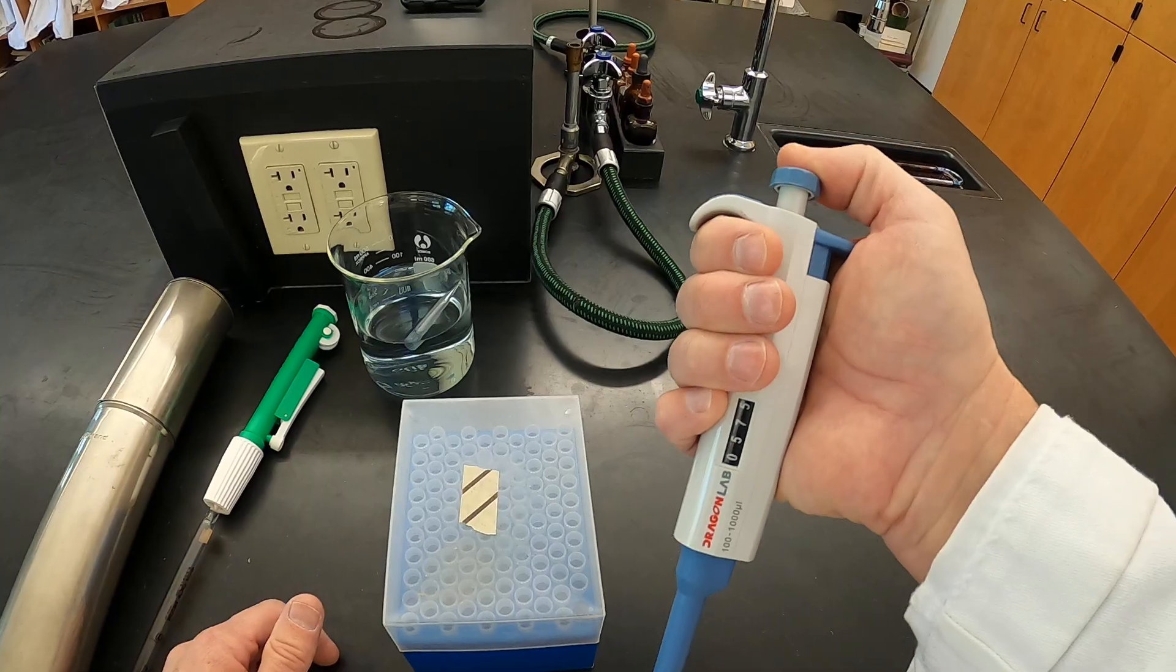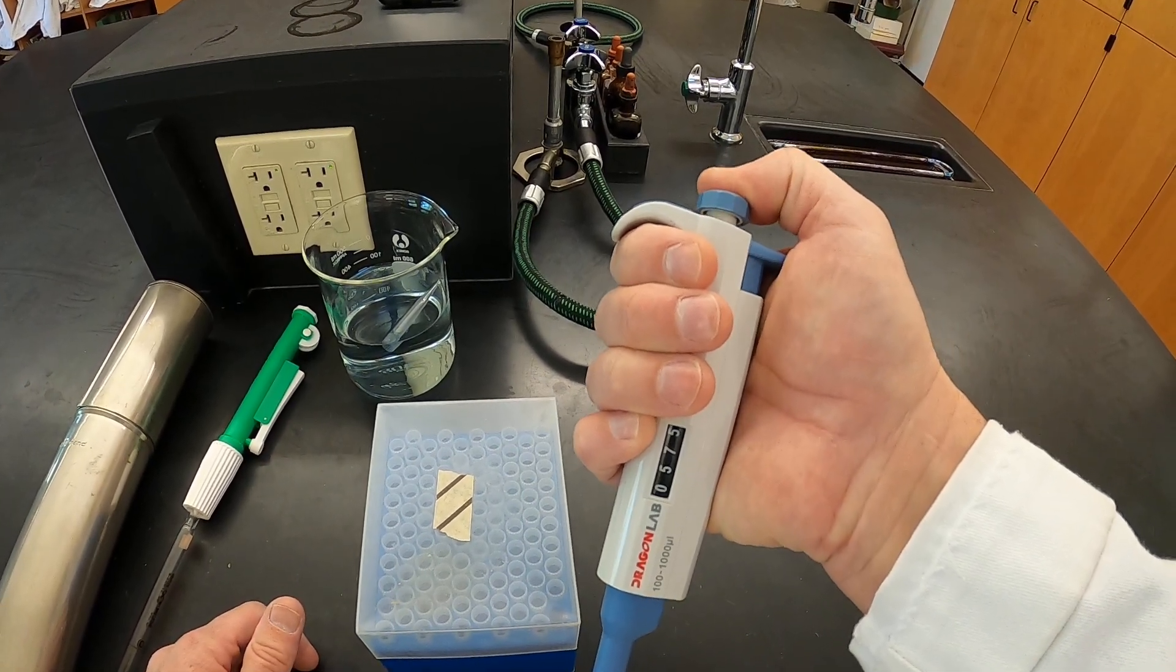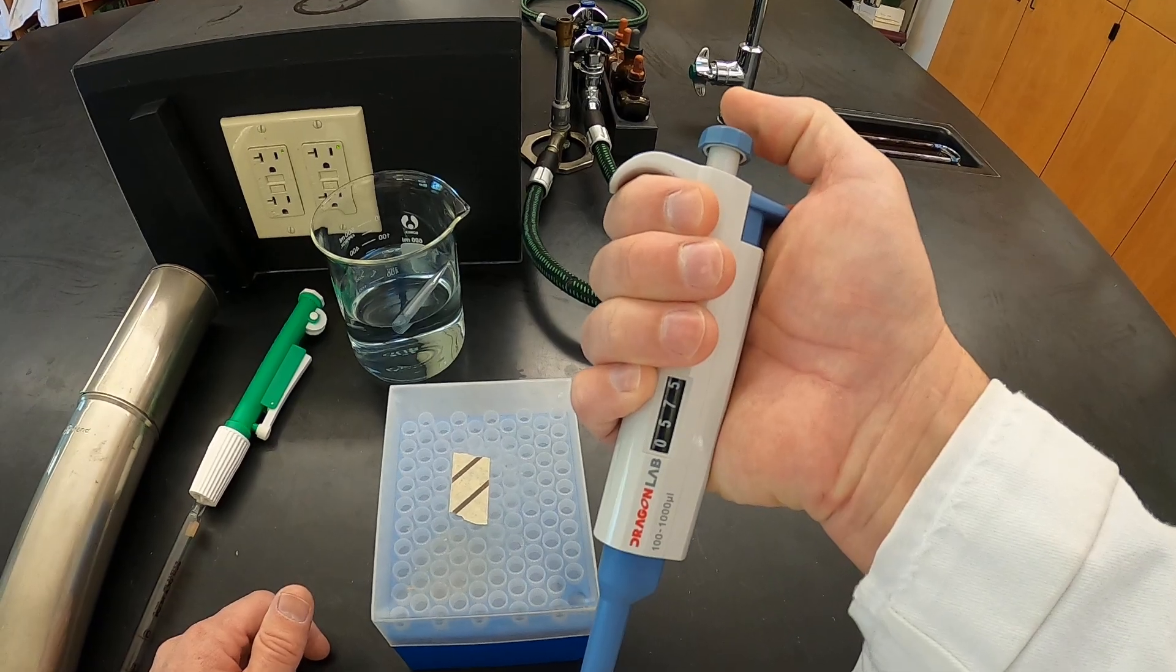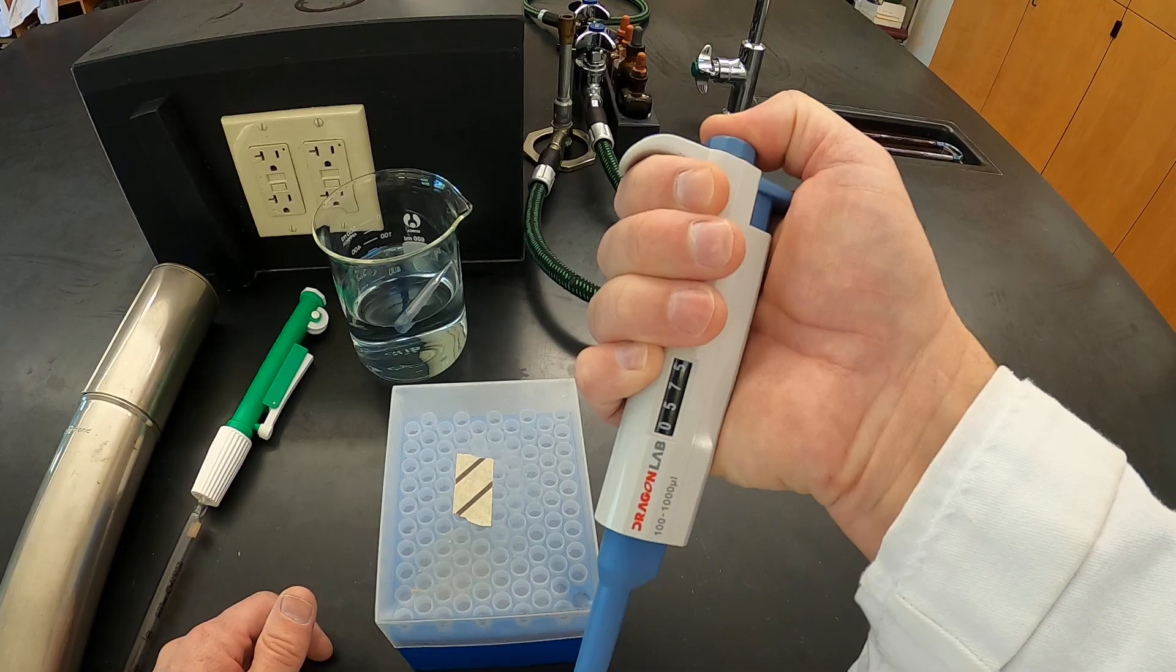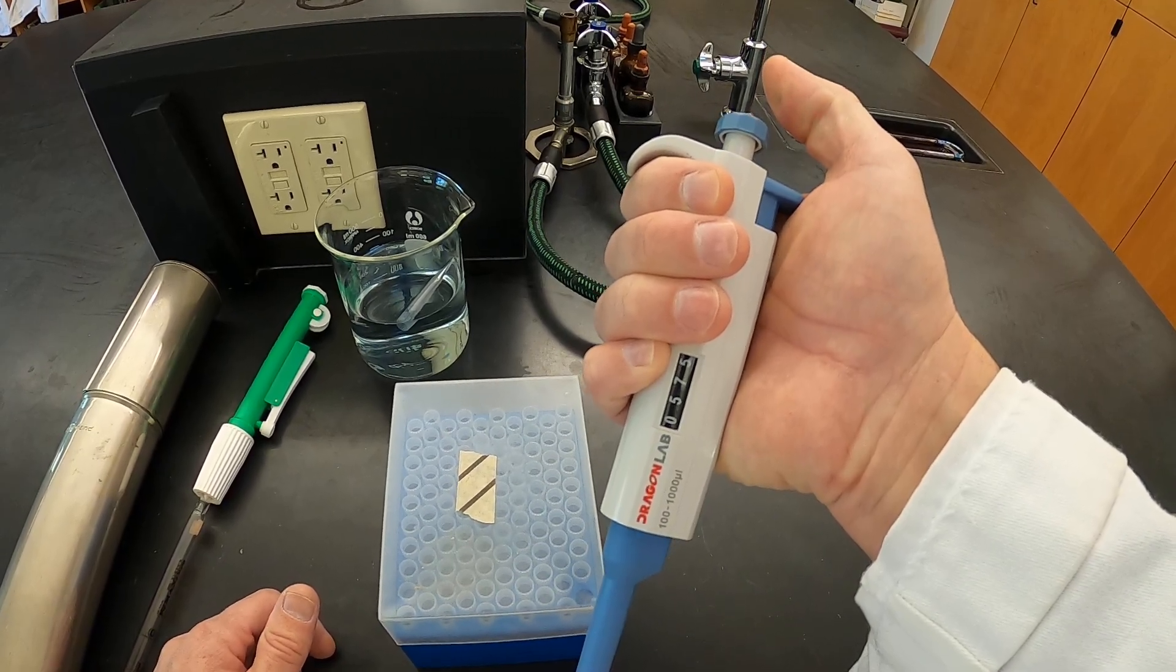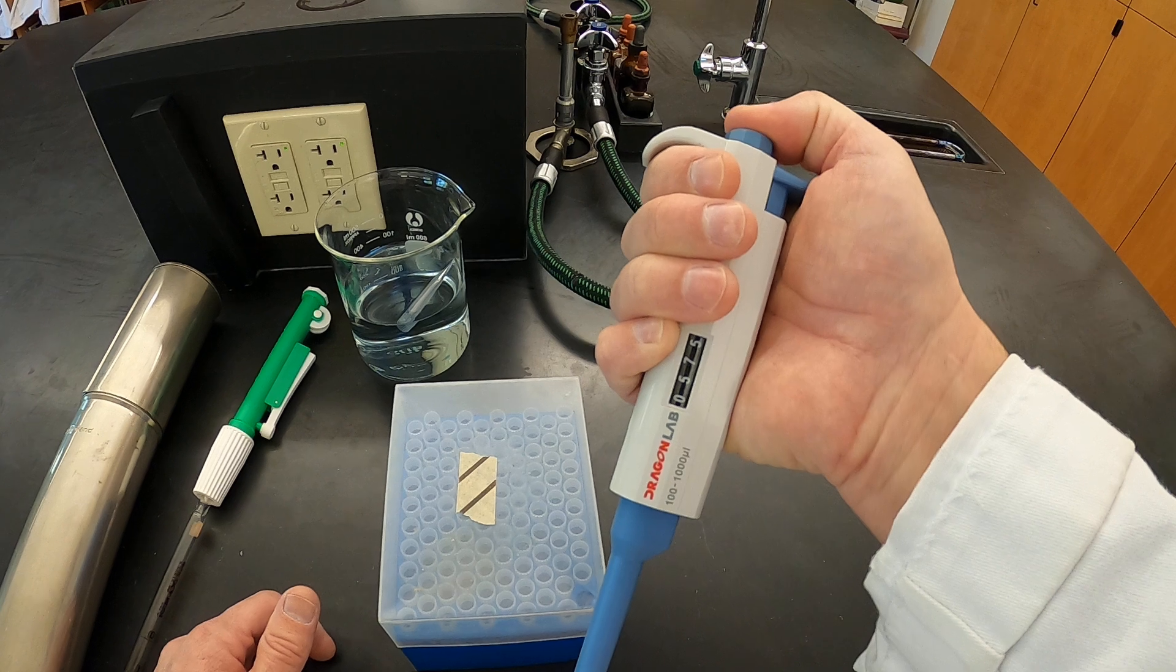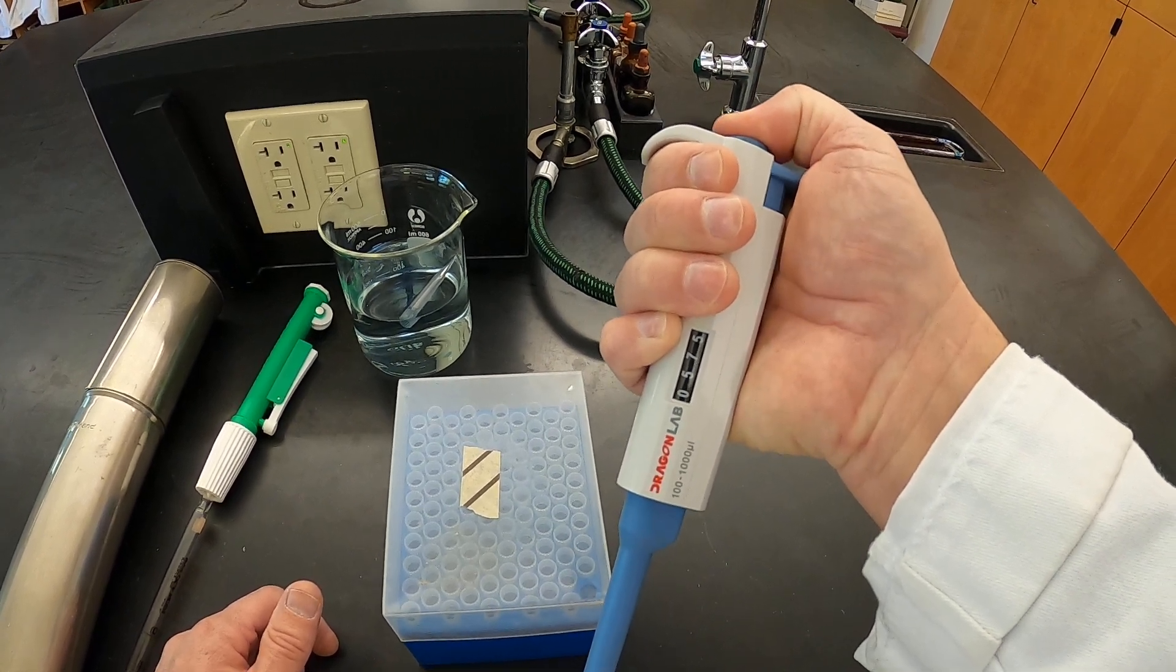You'll notice on the plunger that the plunger actually has two stops. So we can go down one stop, and then if I press a little bit harder, I can press down to a second stop. If we press down to the first stop and then the second stop. Because we're going to go down to the first stop to be able to withdraw our liquid, and then we're going to go down to the first stop and the second stop to eject our liquid.